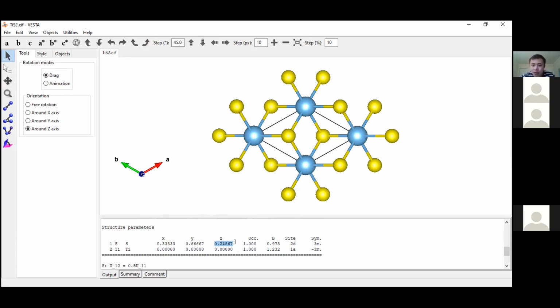So we have such a large ensemble of atoms, but we can describe them using very simple and efficient language. One thing is the space group, which tells a lot about the symmetry. The other thing is the atomic positions. So even though we have two atoms, we just need one parameter to know the exact structure of this material. So that's really the beauty of crystallography, I think.